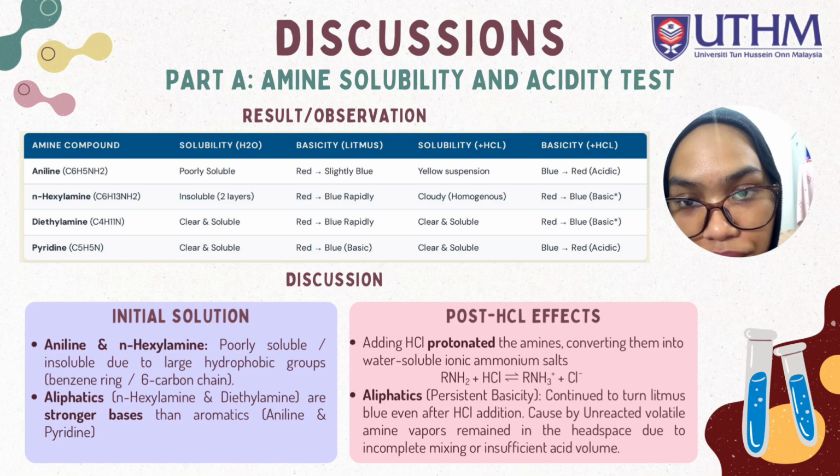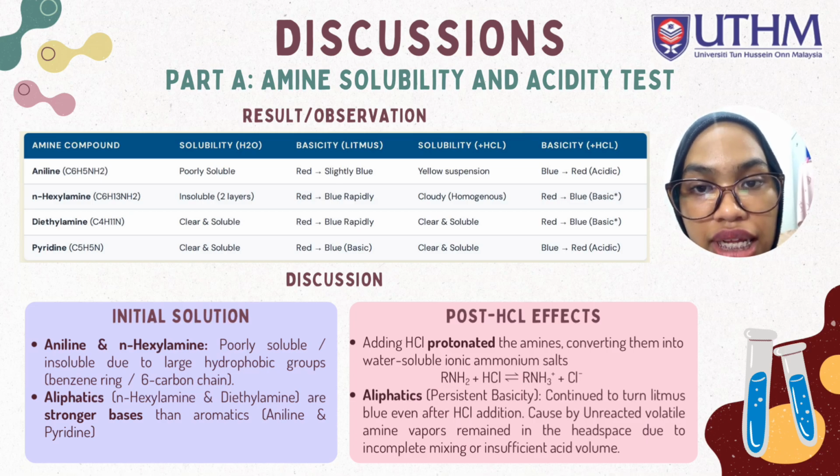Third compound is diethylamine, clear, soluble in H2O. The basicity is red, turns blue rapidly. For solubility in HCl, clear and soluble. Basicity red, turns blue, so it's basic.